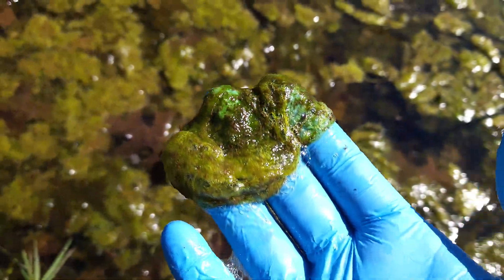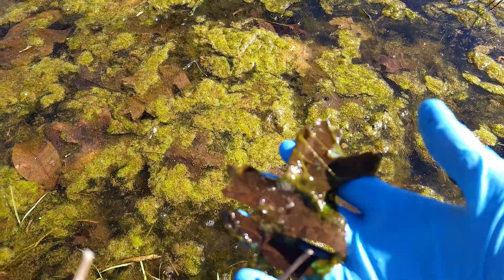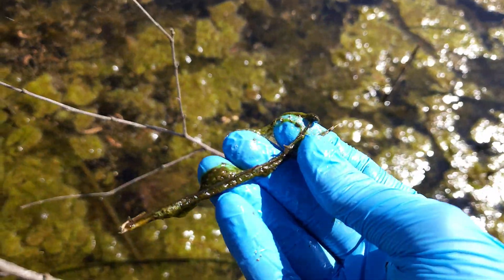Any kind of organic debris like sticks, leaves, algae, bark, or even tiny aquatic plants will be perfect to collect for your sample.